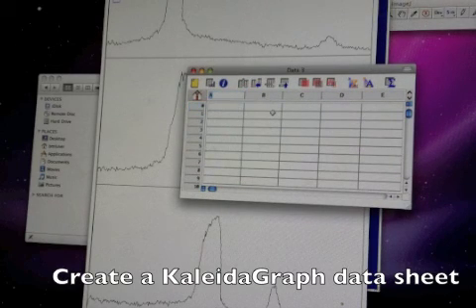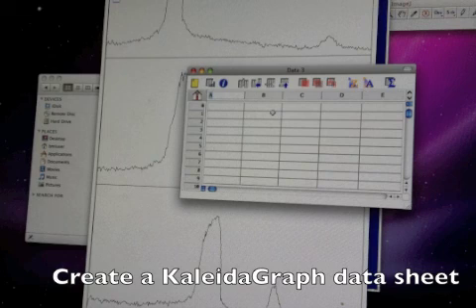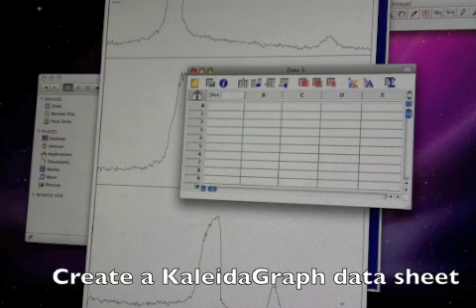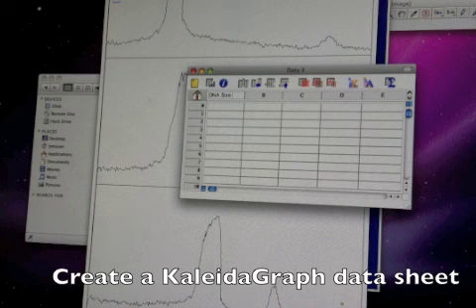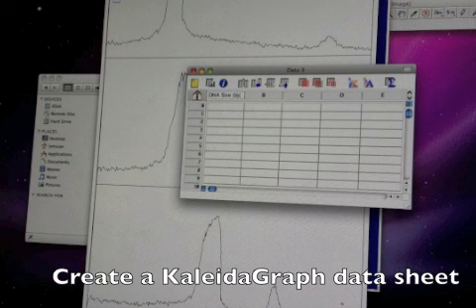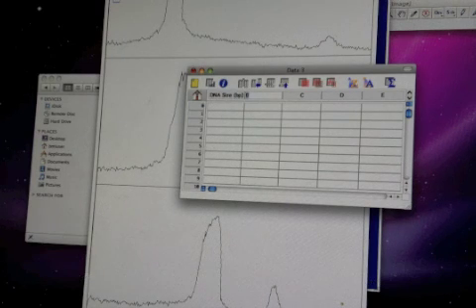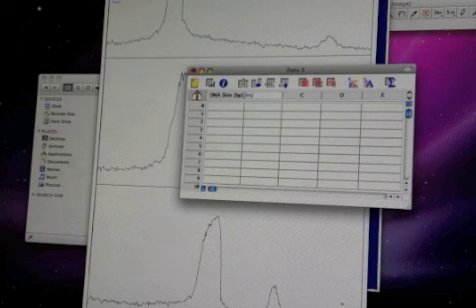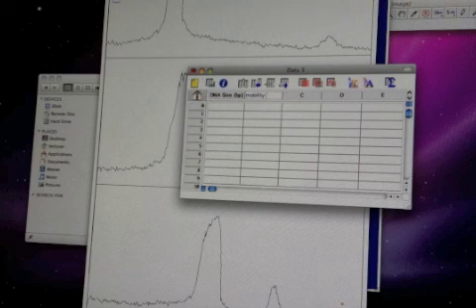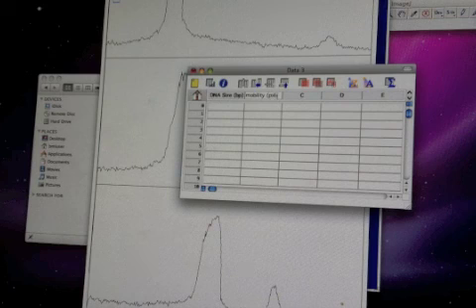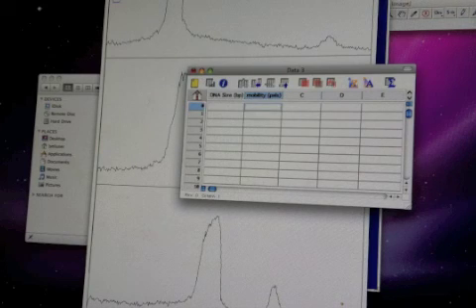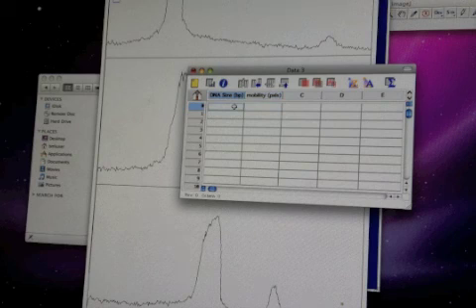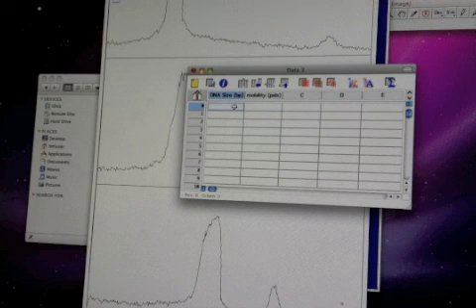To get a new data sheet where the data will get entered, I'll label the first column something like DNA size measured in base pairs, and the second column label Mobility, and this is measured in pixels.